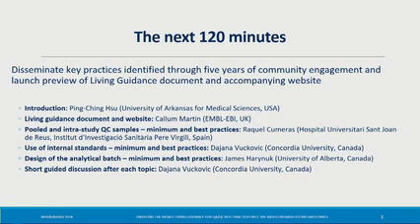These are the presenters that you will hear from. I am Ping-Ching Hsu from University of Arkansas for Medical Sciences in the United States. And Callum from UK will talk about the living guidance document and website. Raquel from Spain will talk about pool and intra-study QC samples, minimum and best practices.